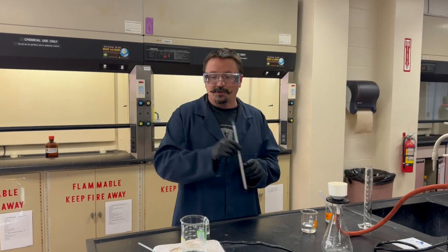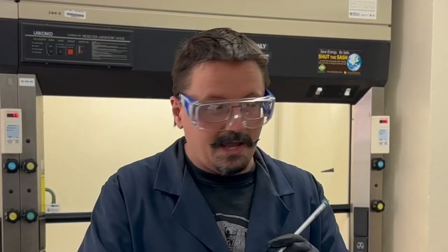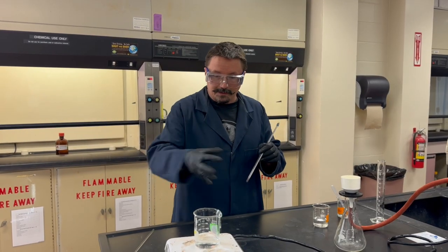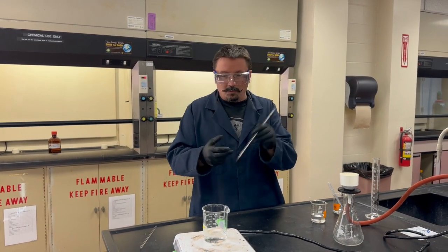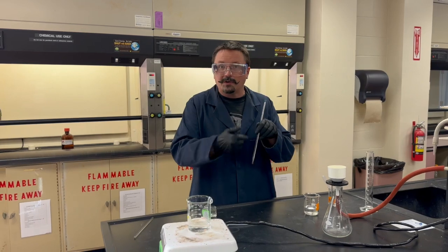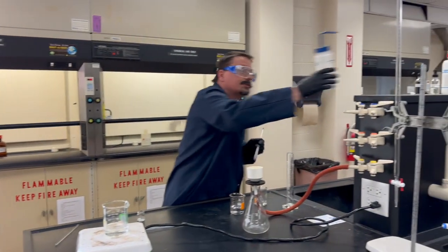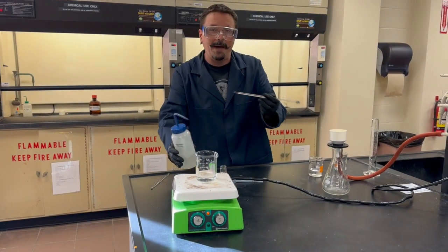Make sure that if you use a stir rod or thermometer, remember your unknown is now dissolved in the water. If you get some of that solution on either of those, part of your unknown will be on them. Rinse them back into the container so you're not losing any part of that possible product.